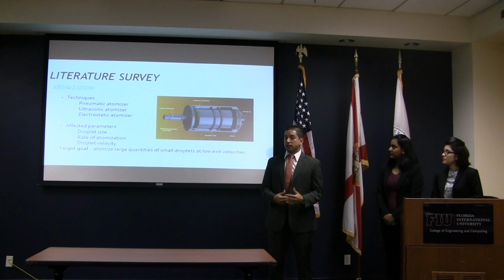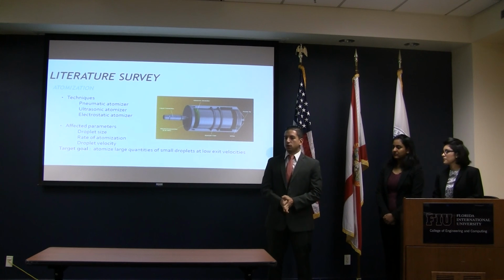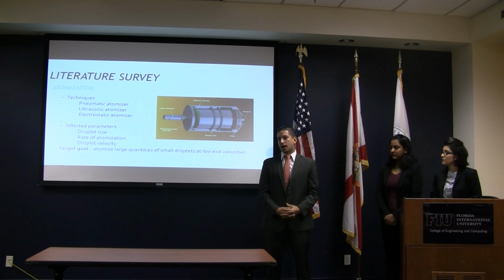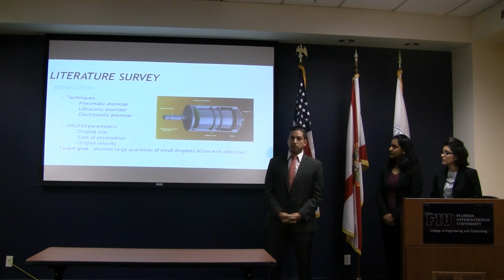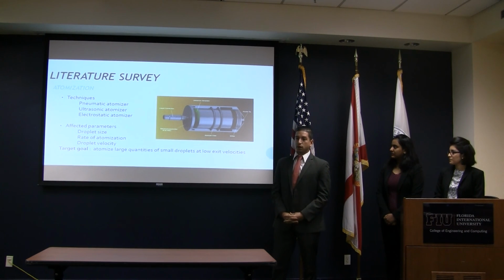For the atomization of the precursor solution, there's three basic techniques used, starting with the pneumatic atomizer, which uses high pressure, high velocity air to separate the particles. Next, the ultrasonic atomizer, which uses high frequency ultrasonic sound waves. And lastly, the electrostatic atomizer, which uses a high voltage electric current that separates the droplets.